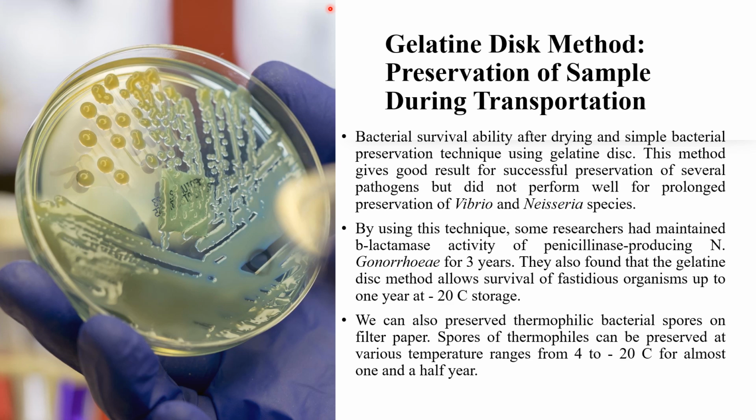Lyophilization is a widely accepted method for long-term preservation, storage of microbial samples, and for transportation purposes. But due to the excess cost of instrumentation, many small laboratories and colleges cannot afford this method.